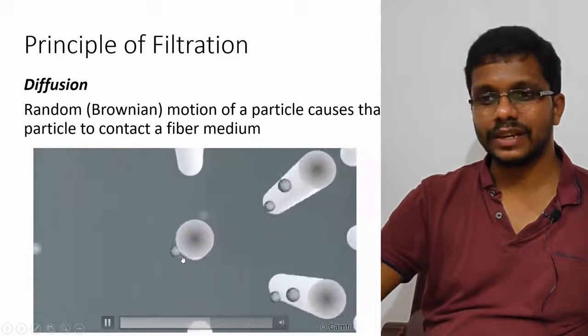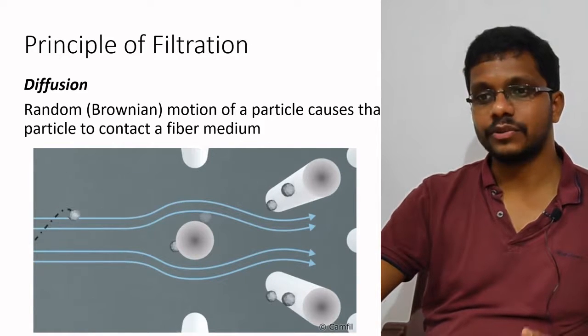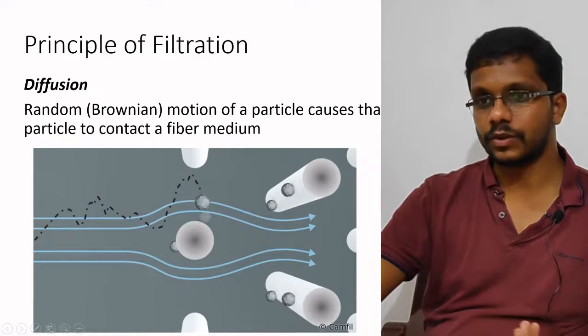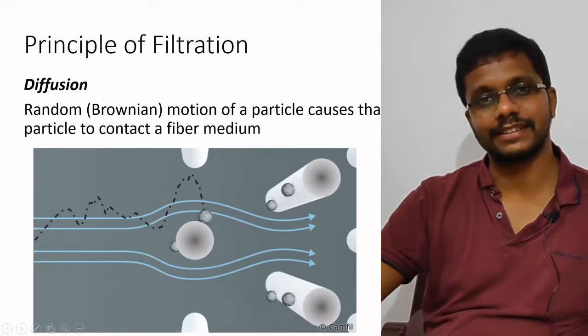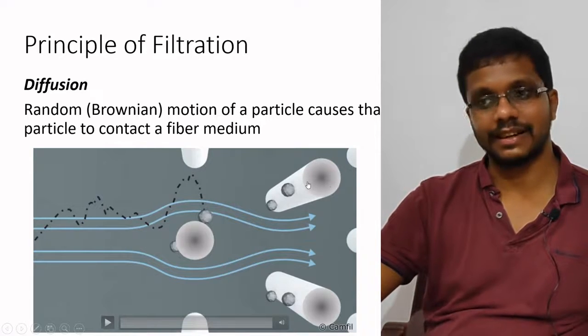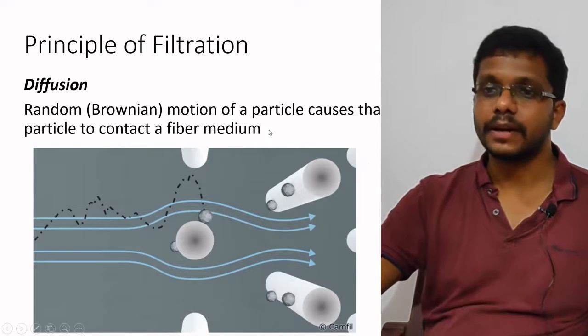These things are not like filtering our coffee. We are using different types of filters to utilize the property of diffusion. Those are the depth filters. You can see multiple layers of the filter media there. So even if the particle misses here, it will be accumulated in another layer. Maybe it has 100 layers, so most of the particles will be trapped.